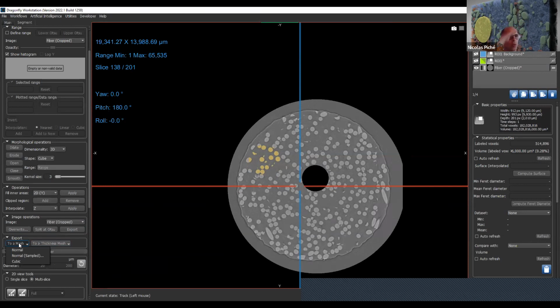A marching cube, which is a mesh with triangular faces that are sometimes at 45 degrees, or a cubic mesh which follows exactly the voxel limits. This type of mesh is useful for people doing FEM, because when you have the surface, you don't want to lose the corner on top of the surface and have a hole in between.